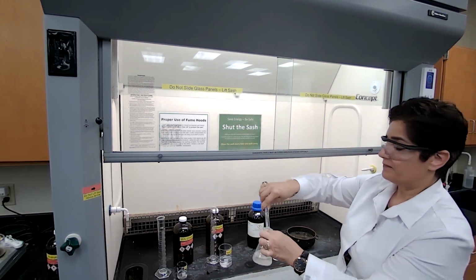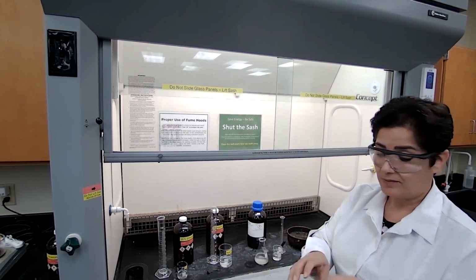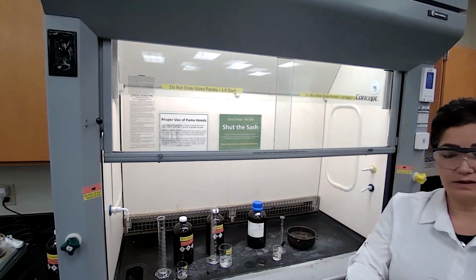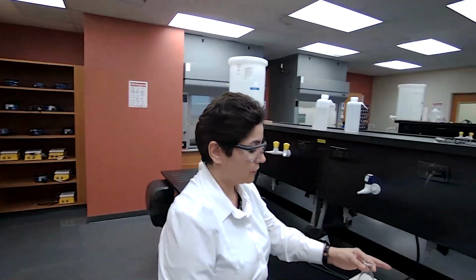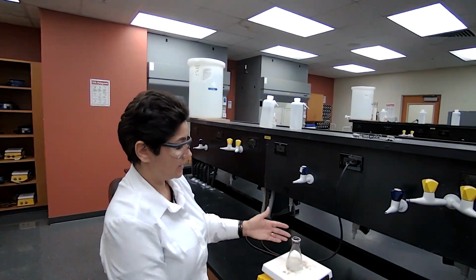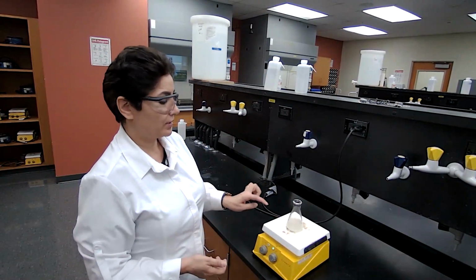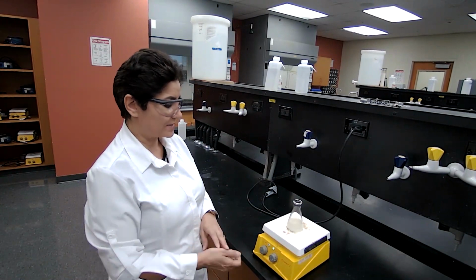Now, based on the procedure again, we are adding a magnetic stir bar to it and placing it on a stirrer, which is the hot plate with the stirring function, for 30 seconds to 1 minute of gentle stirring. This is going to make a homogeneous solution. Basically, benzaldehyde is going to dissolve in the ethanol that we have in the flask.